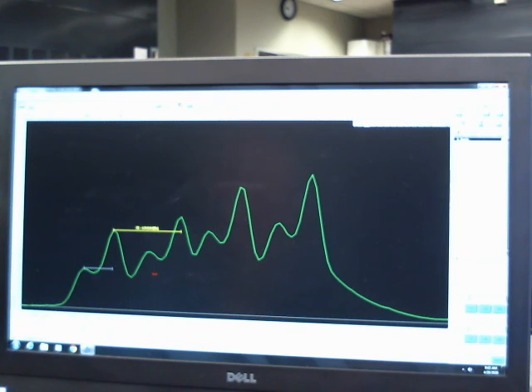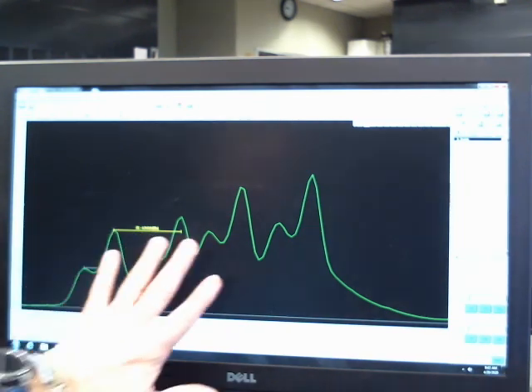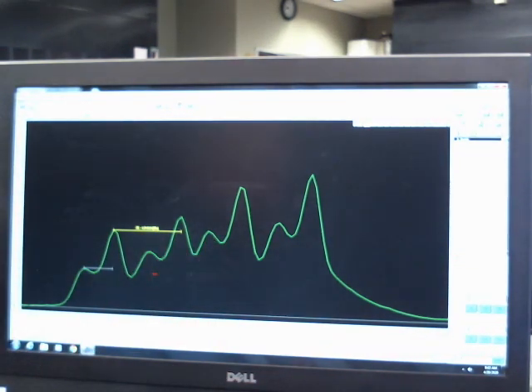And so what we need to do then is match those up with the J's that we predicted through modeling and the Karplus equation for the two possible products. Which does the experimental actually match up to? That's the data that we use to see whether our prediction actually matched up to the experimental.